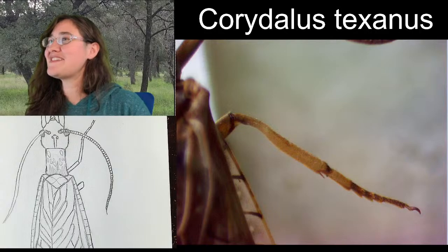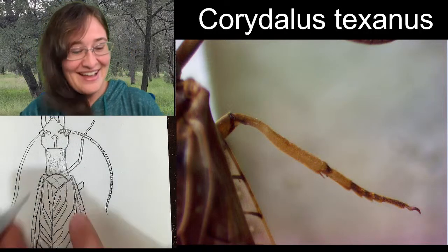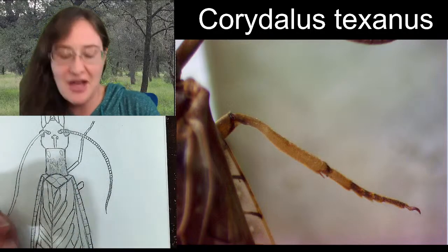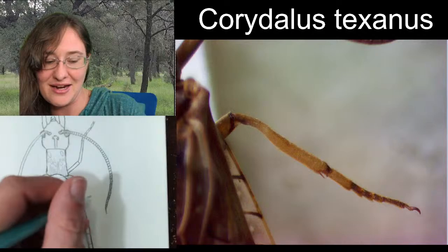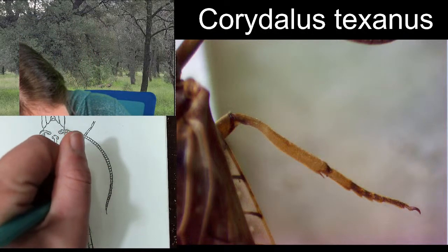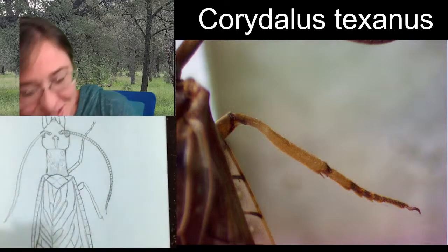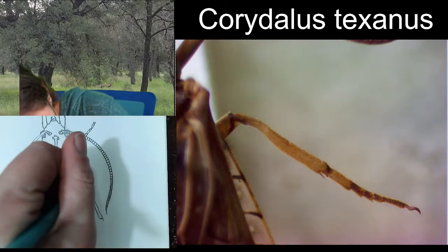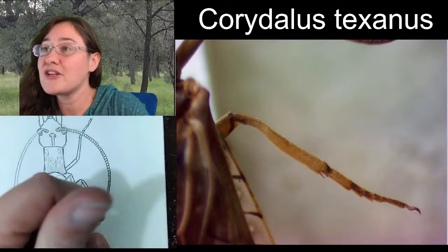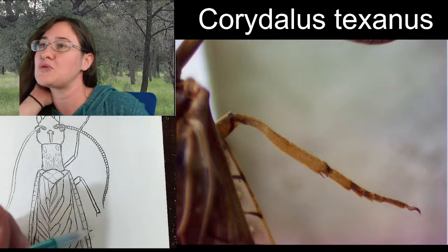We can name the leg shape segments. Sounds like a plan. All right, so we have this femur here. Our tibia is going to be coming down. I'm going to try not to let it interact with this antenna because I would rather not have to worry about that. So I'm going to bring the tibia down in this direction. Let's see. So we've got a tibia here, and we do have a little itty-bitty tibial spur down here closing in towards the body.